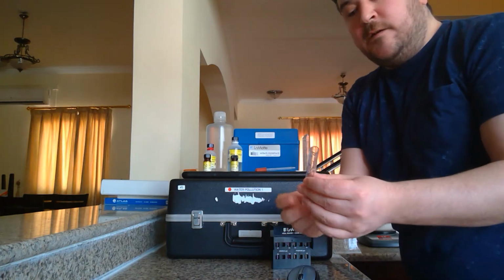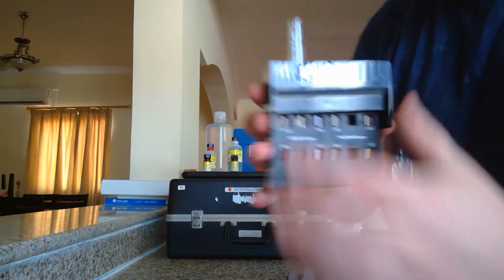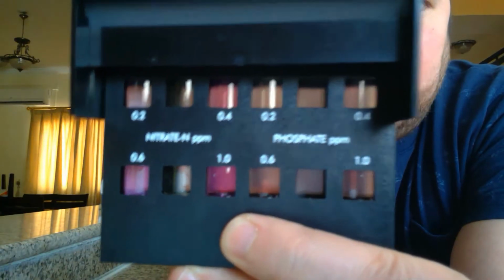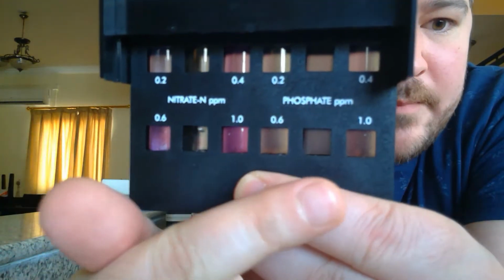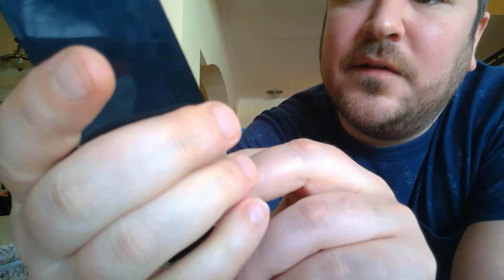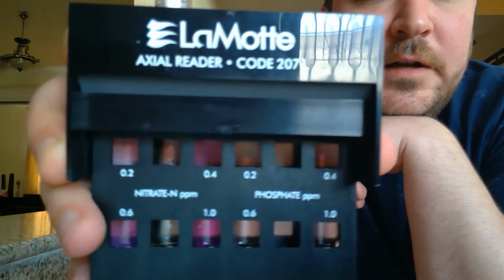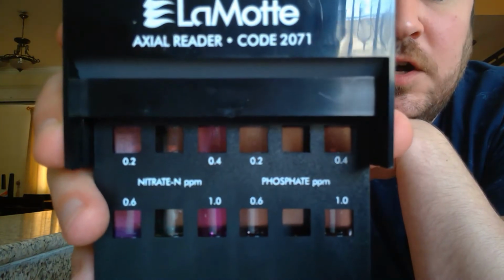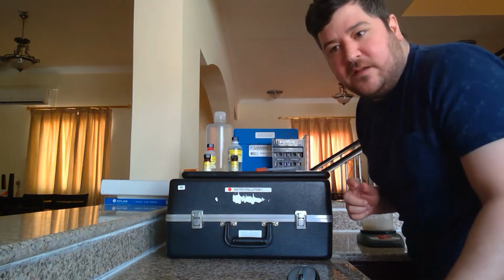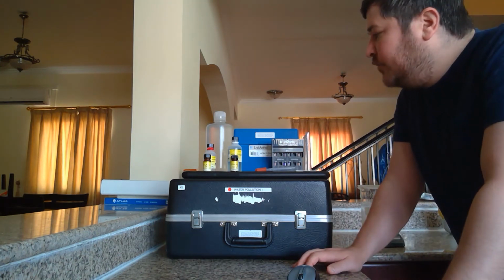I have test tubes here, which are measured, and they're measured because I can put them in this. This is like a reader, and judging by the color of my solution when I do the experiment, it should match something here. So nitrates are over here. It goes from 0.2 to, I think that says 1 part per million, and the phosphates do the same, 0.2 to 1 part per million. I have to compare them based on the color. So I'll do my best to show that in the camera, but if you can't see it, I'll give you the results. So I'll get things cleaned up, I'll get some gloves on, and I'll do the nitrate test.